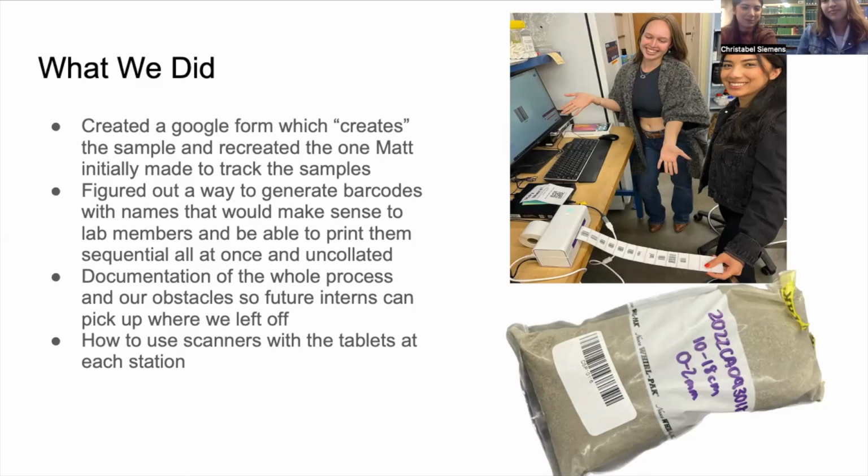Right before you move on, here on the right side we have a picture of one of the soil samples. Those letters that you see right there are how they were identified before. They have their unique identifier up on the top, followed by, I believe, soil depth. And then you see there the barcode that it has now. It's like CSPS, so that's probably the field name where it came from, along with some numbers after it.